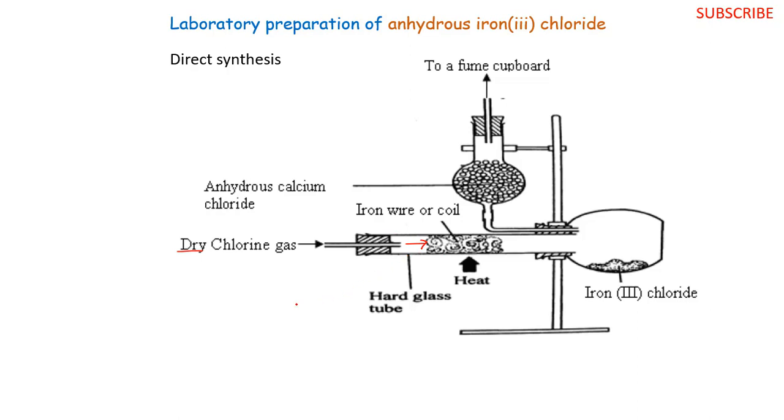Our dry chlorine will come and then it will be reacting with our iron wire. But before we do that, we must first ensure that we make our setup free from air. Before we start heating our iron wire, we shall pass some chlorine gas through our setup, such that we drive out all the present air so that our iron does not react with any oxygen or any other gas that might be present.